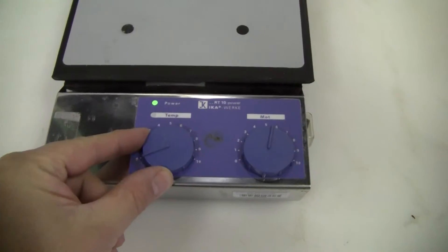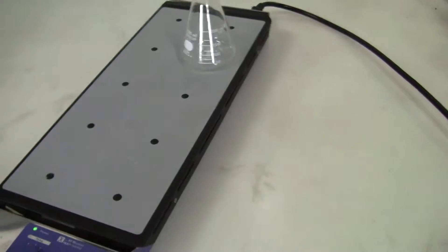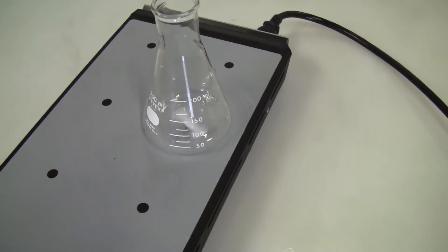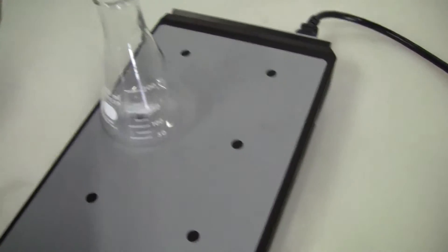You can see the temperature here and the motor control speed. We have a 250 ml flask — probably the highest you really want to go on that.